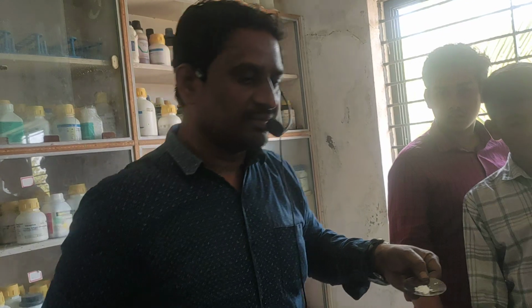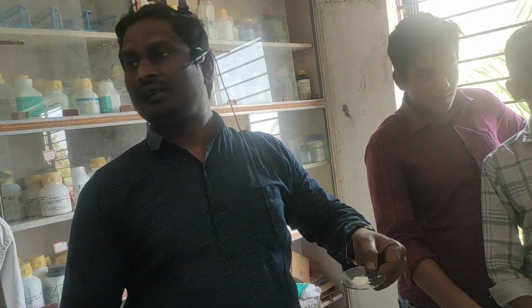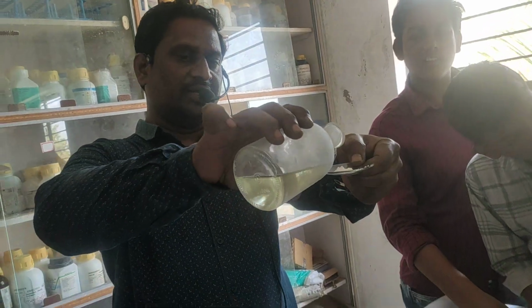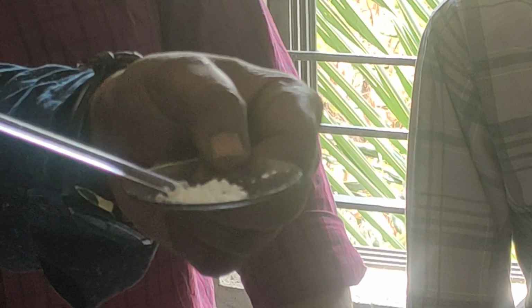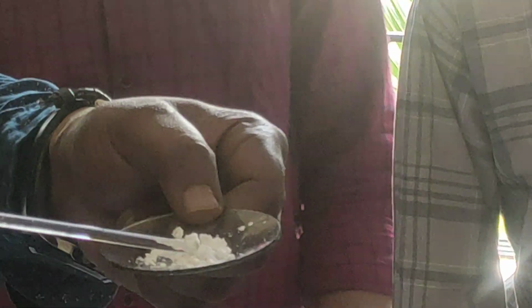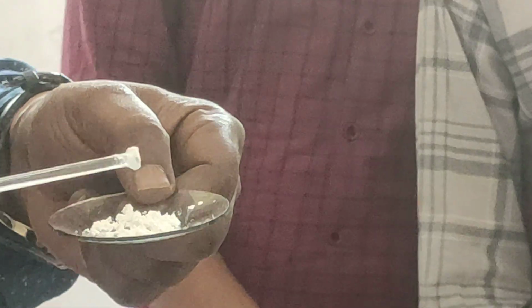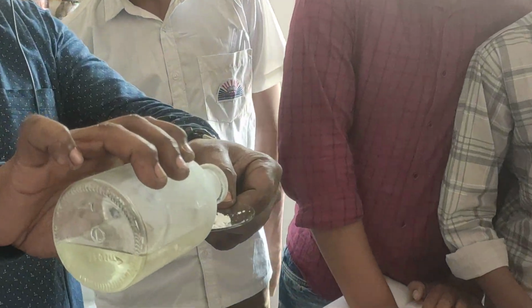Where is the dropper? I'm adding just one drop only. Now make a paste with the glass rod, and bring it near the flame. It is still not sticking, so one more drop I'm adding.